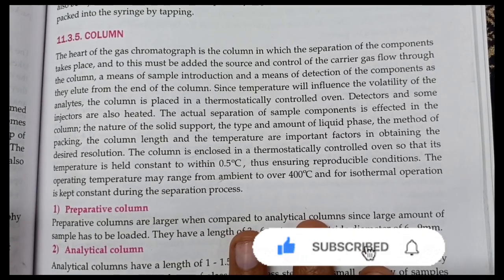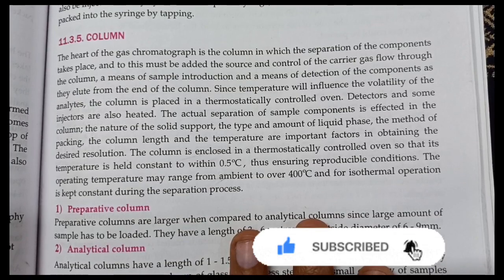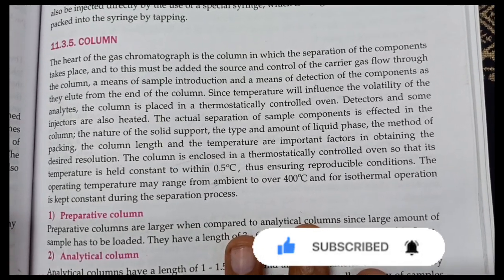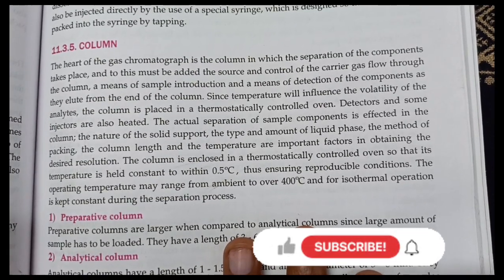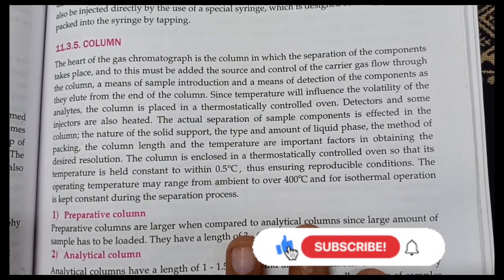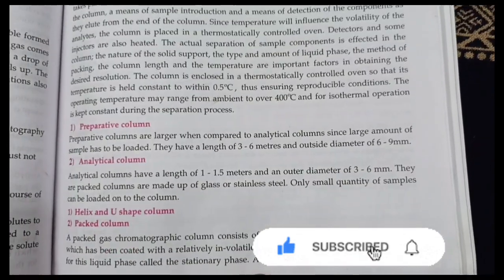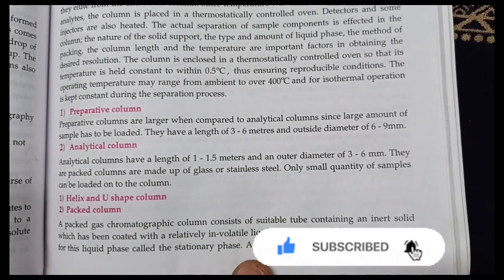Since the temperature will influence the volatility of the analytes, the column is placed in a thermostatically controlled oven. The column is made of glass or stainless steel. There are several types of column.